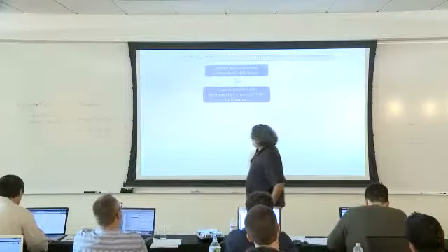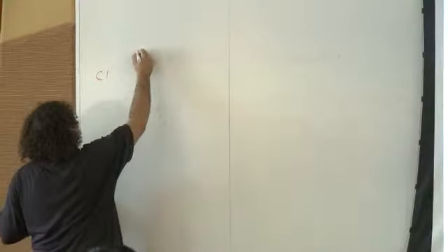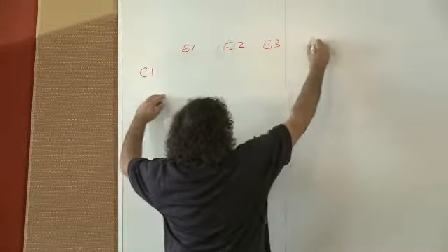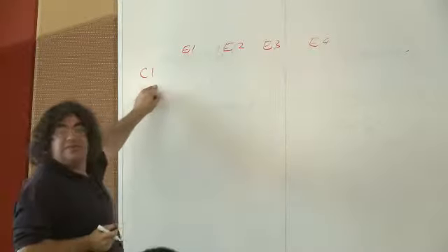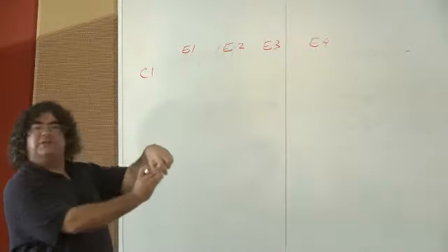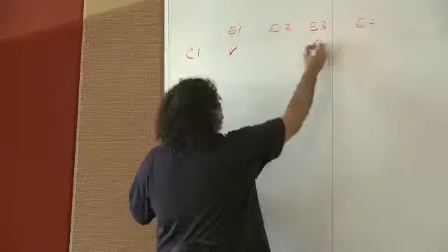So using this data, you say, okay, now I know where I'm going to have cell type 1, cell type 2. Let's start with cell type 1, okay? I can list here all kinds of enhancers that I find that seem to be active in cell type 1. So these would be places in the genome that show this combination of histones that mark an active enhancer. And I say, okay, that's active here, and this one is active here.